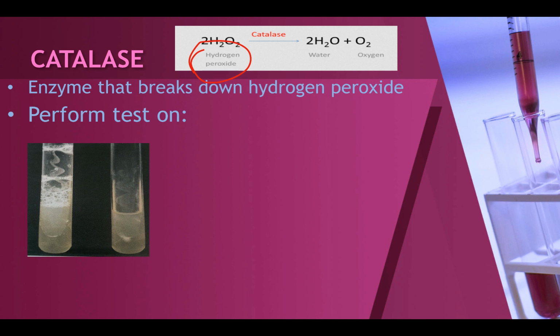First, you can simply purposely grow up a slant of your organism and pour the hydrogen peroxide directly into the slant after the organism has been allowed to grow. The downside of this, however, is that if you were planning on reusing the organism, you wouldn't be able to. So it is always best to grow this up ahead of time if you want to use this method, because once you use it, then you must dispose of the tubes.